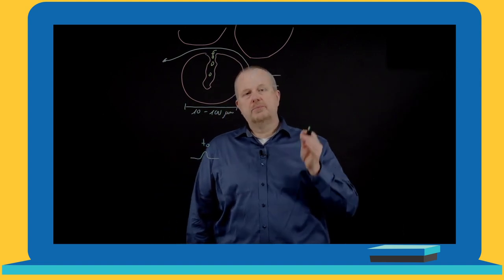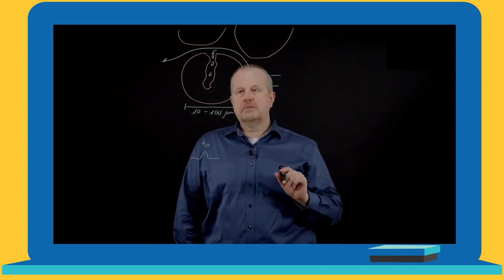And here something very important happens. Up to this point, we have convection. So the faster our pump is pushing the mobile phase through our column, the faster our compounds travel. As soon as the compound enters the pore system, it's transported solely by diffusion. And diffusion is much slower compared to convection. So it takes a relatively long time for our compound to travel along the pore system.